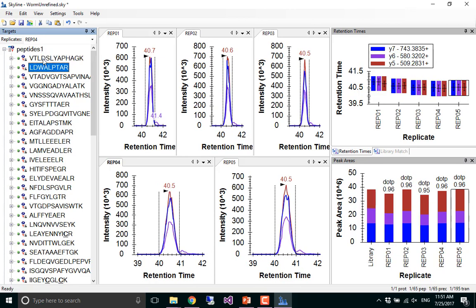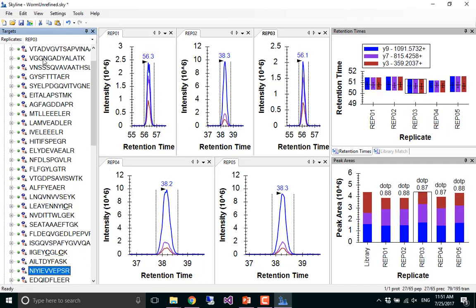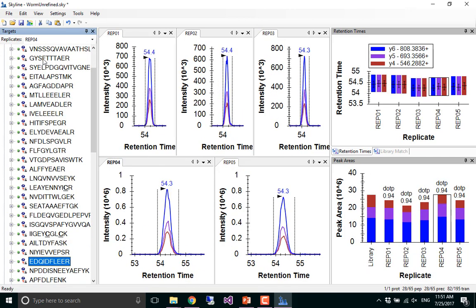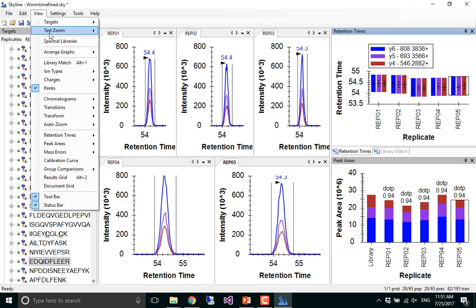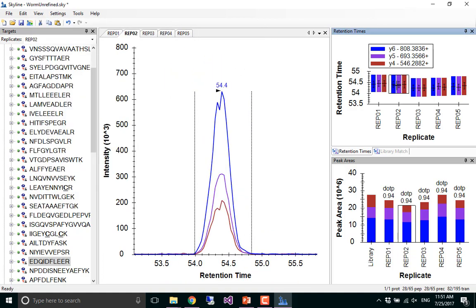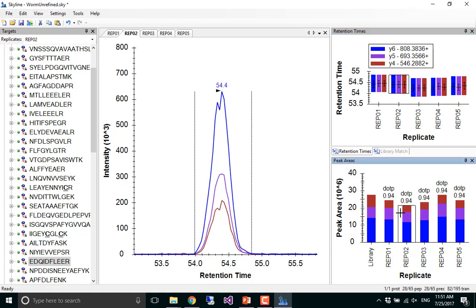So, I think you could go down through these fairly quickly, and they're all really nicely integrated. And oh yeah, that's the selection. So if you click, right, and then you can also click here, right? If we go back to View, Arrange Graphs, Tabbed, that can be even more useful because the box is around the one that I'm clicking on, right?